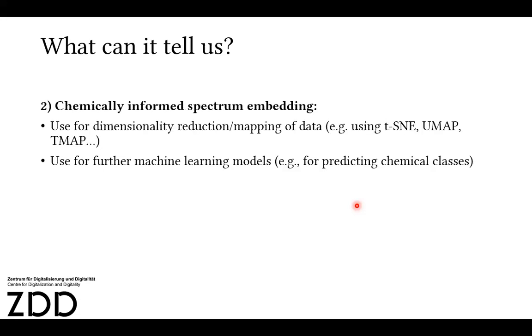That is to get chemically informed embeddings. Embeddings means we get these vectors out, a row of abstract numbers, and hopefully they somehow represent, although we derived them from a spectrum, chemistry that's decoded somewhere in there. This we're going to see in the notebook, I hope. So I switch back to the notebook.